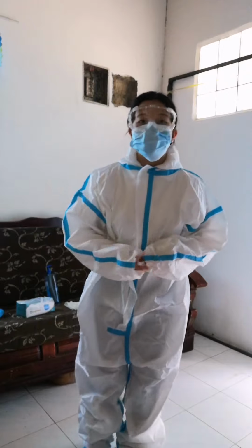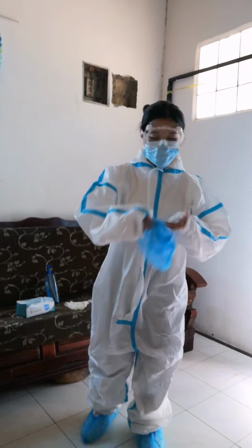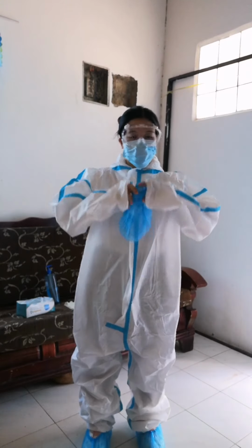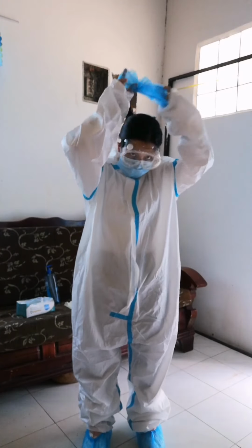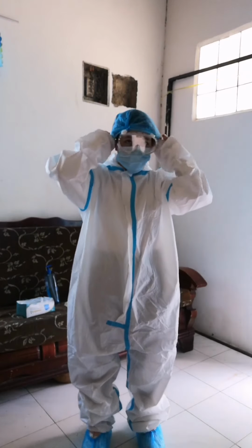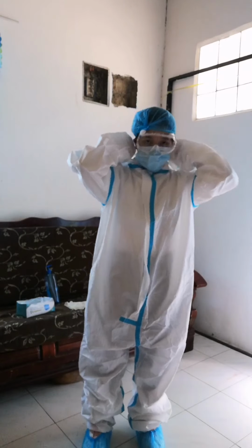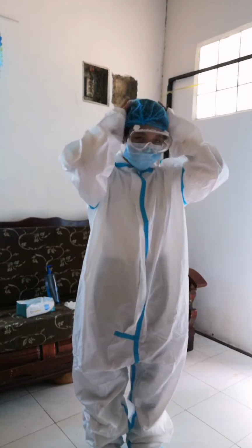So next is to don our bonnet. This is mainly to avoid touching our hair and avoid our hair from falling down. We must place the bonnet and adjust its fit to our head or to our hair.